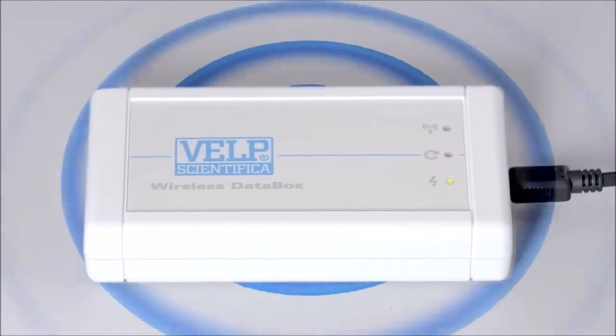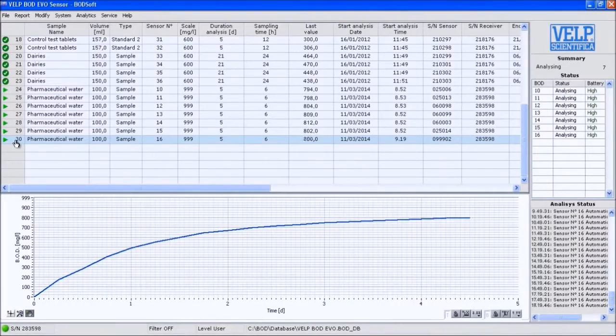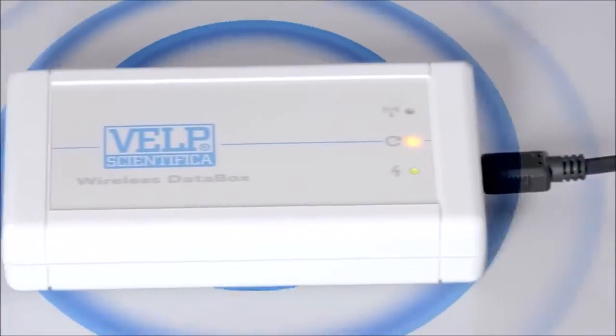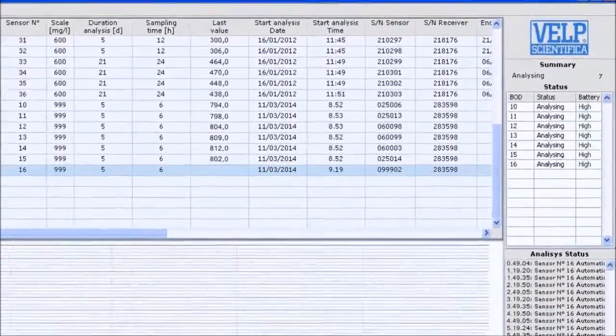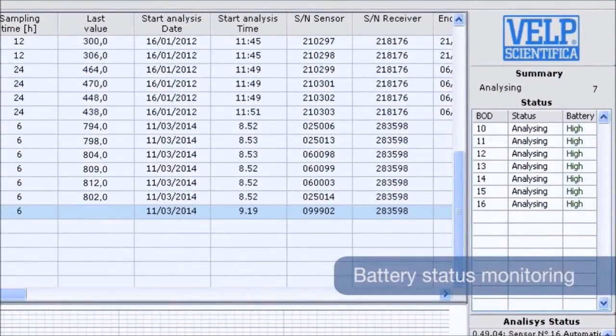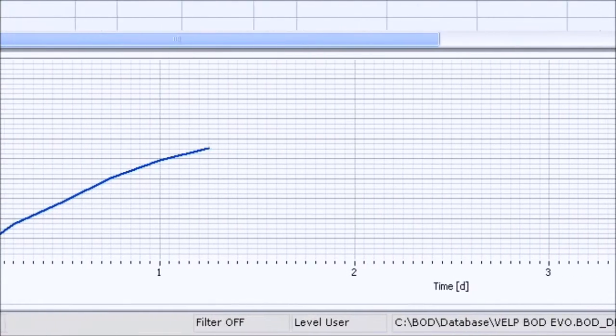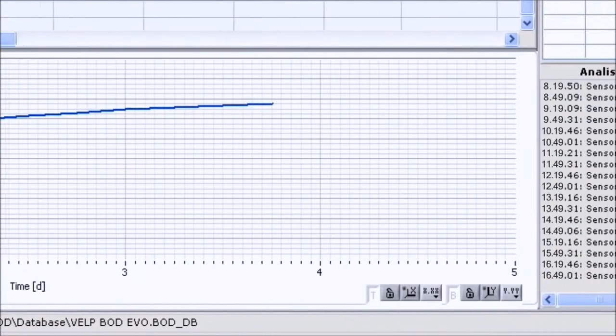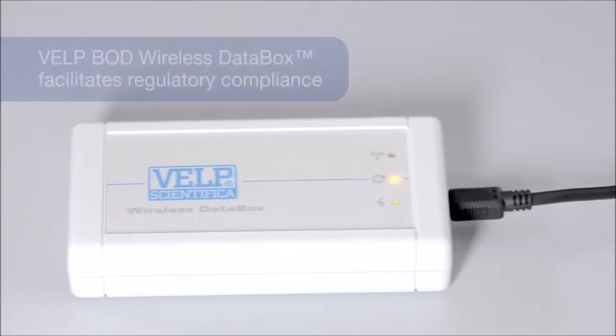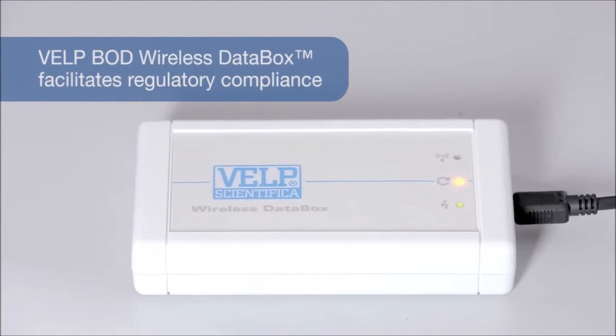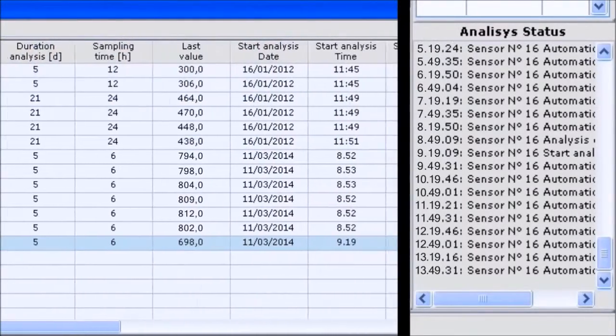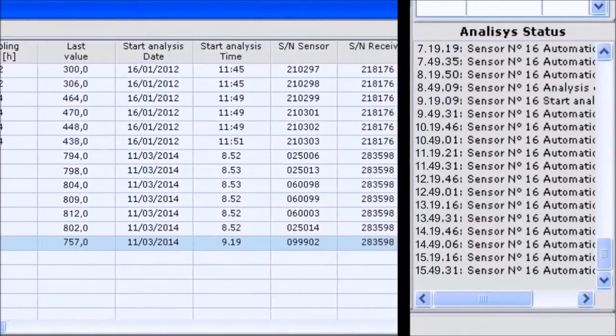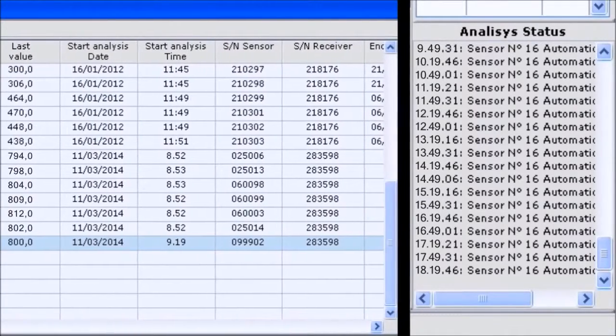Forget about the analysis. The results will be sent automatically to the wireless data box. All the most important info are constantly shown, including the status of the sensor's batteries and a database with automatic real-time graph creation. The exclusive wireless data box facilitates regulatory compliance, continuously monitoring and reporting parameters shown through BOD Soft when connected to a PC.